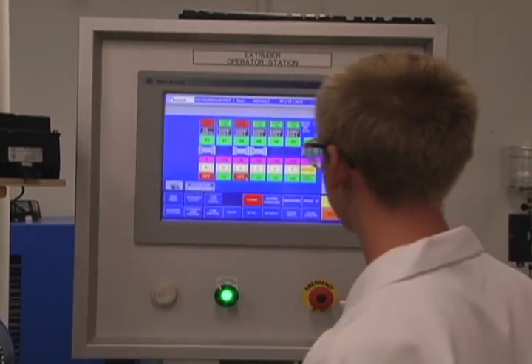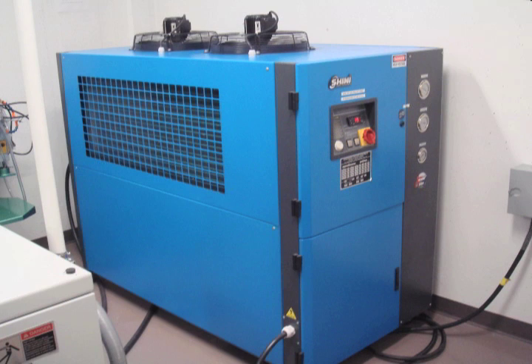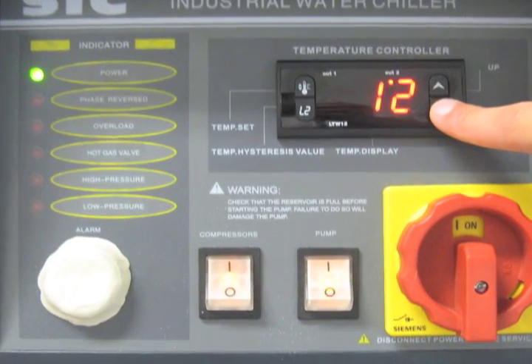Each of the pulverization zones has an independent temperature control. The cold barrel and screw environment is maintained by a recirculating ethylene-glycol water mixture kept at negative 12 degrees centigrade by a 10-horsepower capacity industrial chiller.